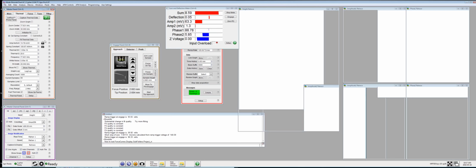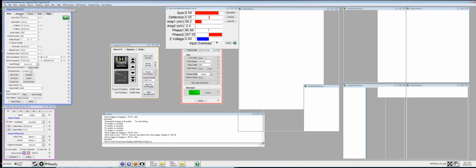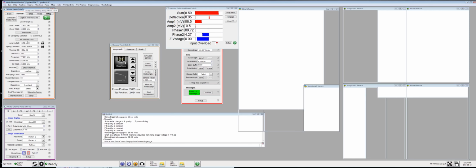So the first mode was already calibrated, and now this should be the calibration of the second mode. One thing to remember, before we stop the software, is to remind the software that the actual amplitude in volts is 48.82.